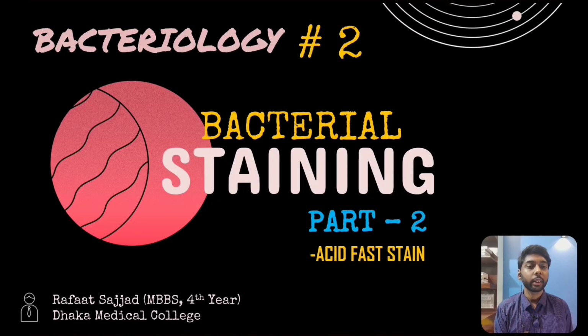So as a continuation of the last video, in this video I will touch on the topic of acid-fast staining. For those of you who haven't watched the previous video, in that video I talked about the basics of staining, and also I talked in detail about gram staining. If you watch that video before watching this, I think it will be at least a little bit easier for you to understand whatever I explain in this one.